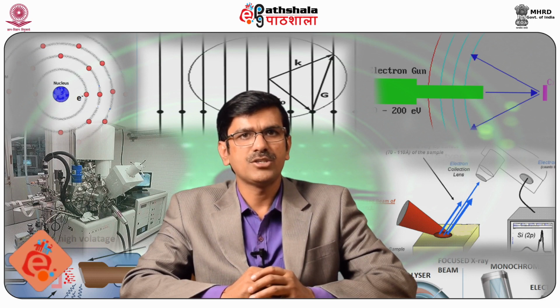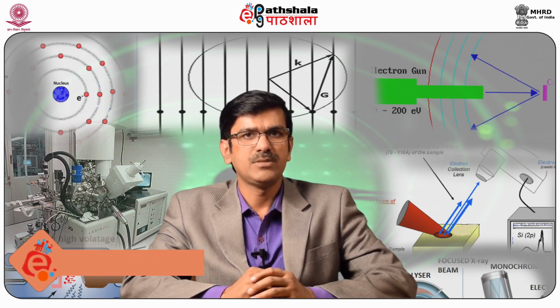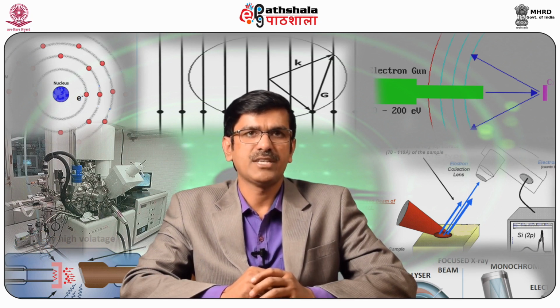The ion gun is not the primary excitation source in XPS, and it is used for large area specimen cleaning, and it provides a means of compositional depth profiling in surface analysis.